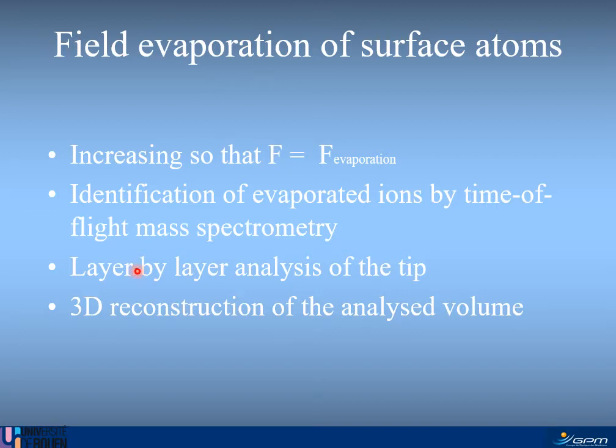And so you can analyze the tip layer by layer, and in the 3D atom probe, the atom probe tomograph, you will be able to have a 3D reconstruction of the analyzed volume, with both the identification of atoms by time-of-flight mass spectrometry, but also the position of atoms in the 3 dimensions of the analyzed volume.